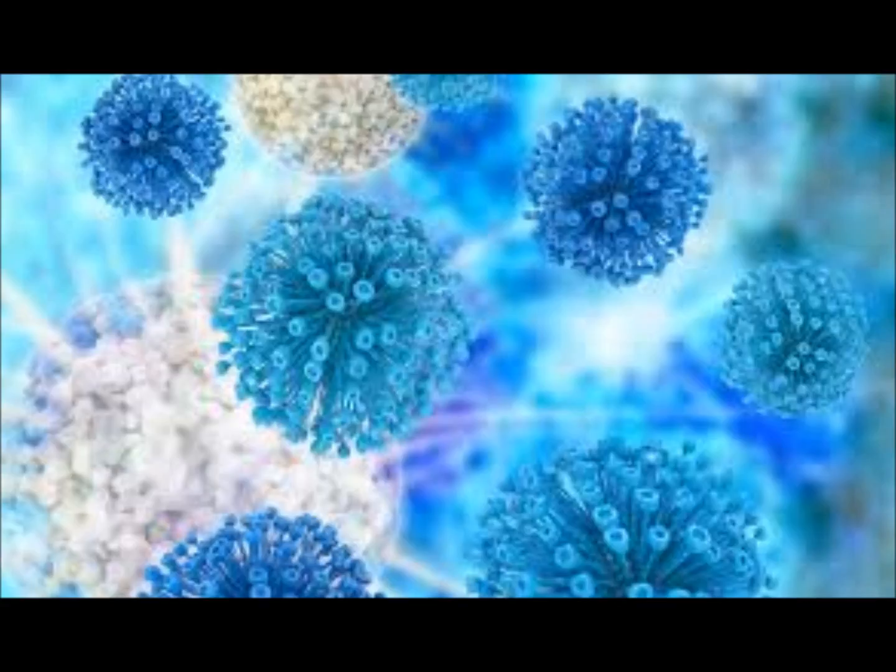Okay, then Katie, tell me what was the last plate you had to look at yesterday? The CNA? And then what did you want on that one? You wanted to know if there was growth or no growth. And if it grows, it tells you what? Gram positive. So we're lucky, this is the first time we've ever had enough CNAs to do it the first round. So you already know if it grows on MacConkey's and the blood, it's a gram negative. If it grows on the CNA and the blood, it's a gram positive. That's already helped you, okay?